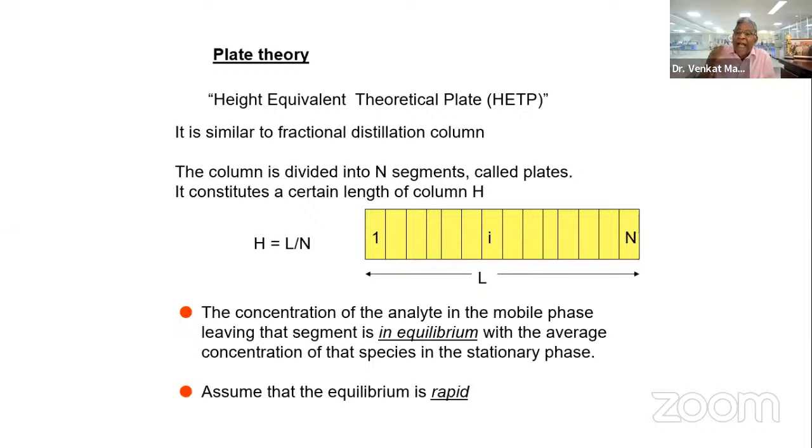It means I have distilled hexane from toluene. It means one distillation cut, one temperature at which the entire volume of the hexane has been taken away from toluene. Such one distillation cut is called one theoretical plate.